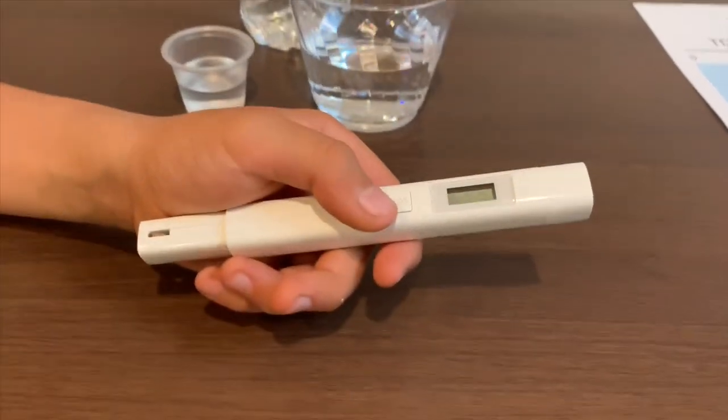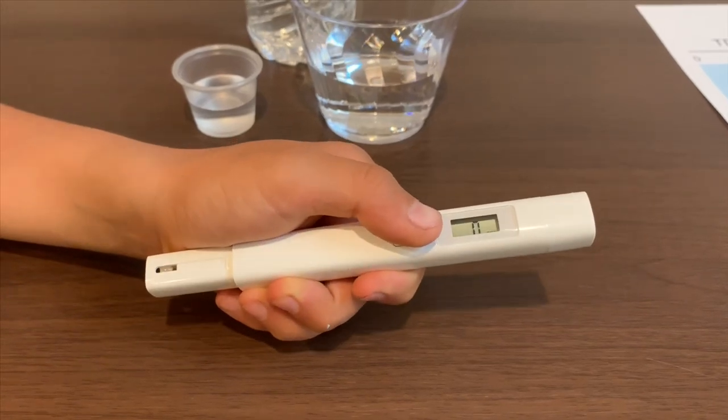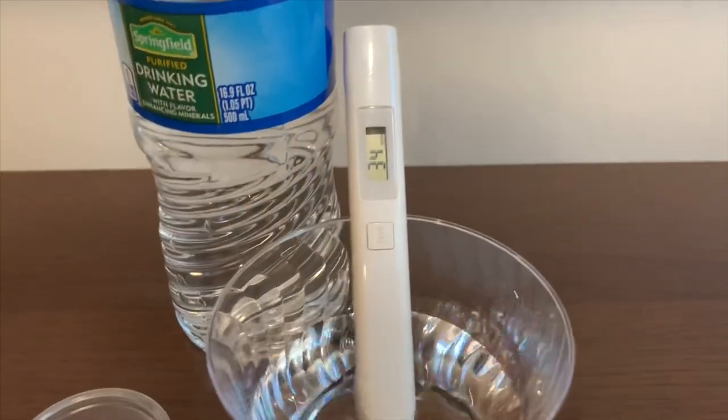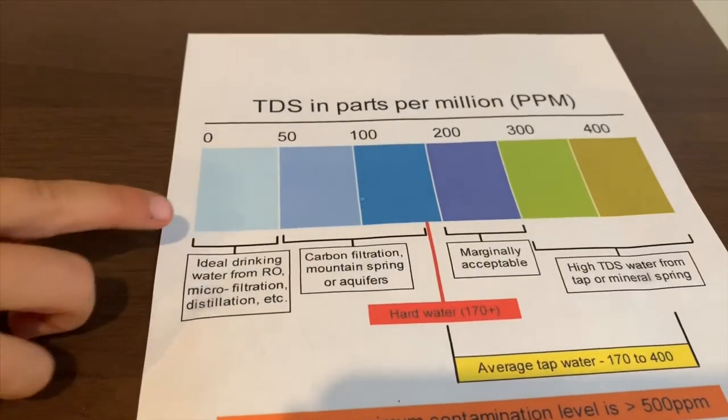If you want to buy this TDS tester, check the link down below. Turn on the TDS tester, make sure it says 0, and put it in. 34 — that is ideal drinking water.